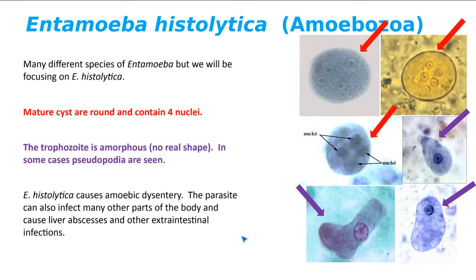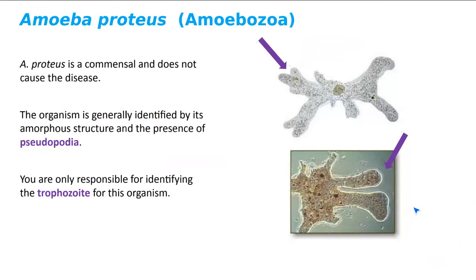The next one is Amoeba proteus. I'm showing this mostly because it allows me to test your ability to identify pseudopods — the pseudopoda. The pseudopoda are pointed to by the purple arrows. There are going to be lots of pseudopoda. It's a commensal — it doesn't cause disease — but it shows the structures very well. One student in 1406 just wanted to watch the amoeba for the entire hour because they found it so fascinating, especially because it was feeding.